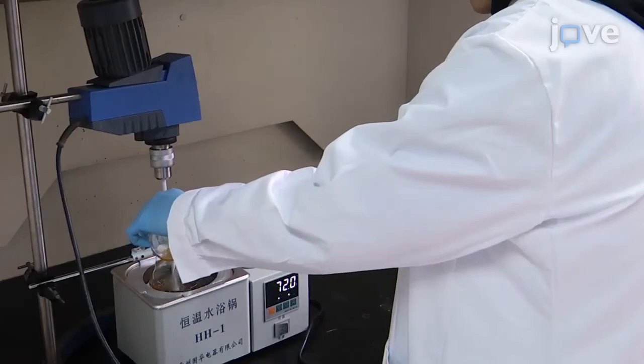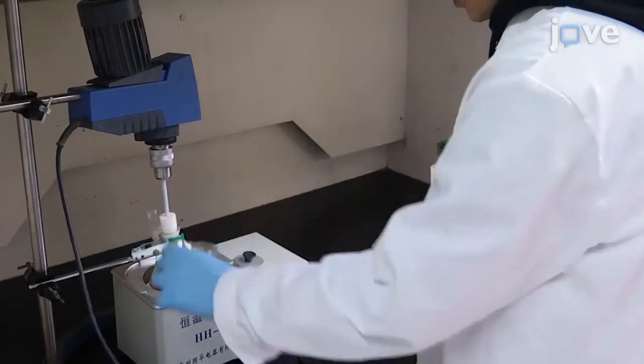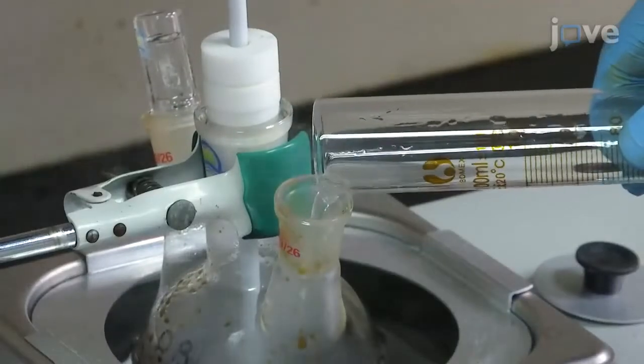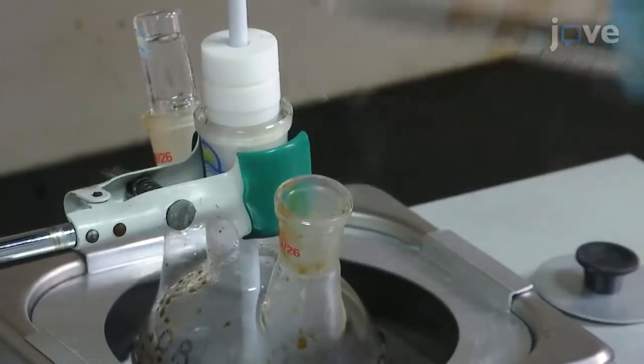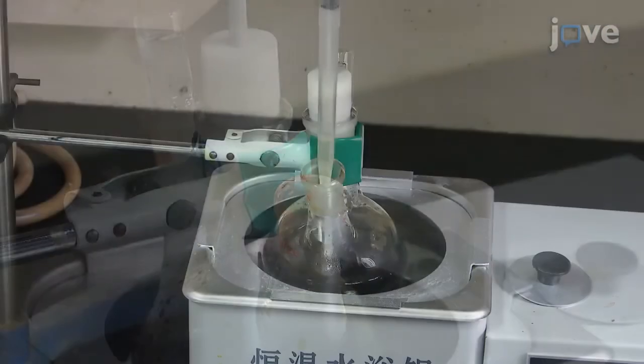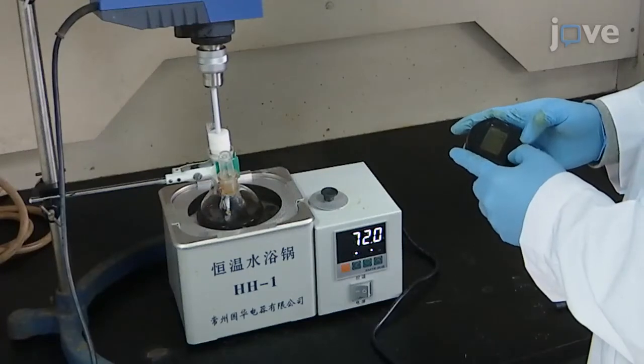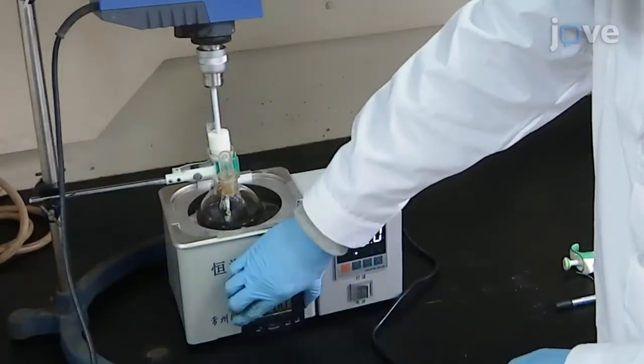Heat the reaction mixture to 72 degrees Celsius with stirring at 800 rotations per minute, and add 40 milliliters of 28% ammonia water to the beaker. After 5 minutes, add 9 milliliters of oleic acid drop-wise, and maintain the mixture at 72 degrees Celsius for 3 hours with continuous stirring.